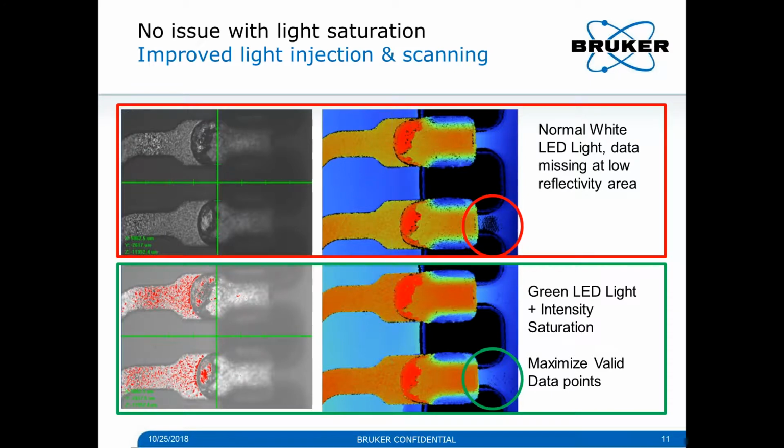First of all, when we think about white light interferometry, there is a sensitivity toward light saturation. But on some occasions, especially for rough samples like wire-bond surfaces, you may want to bring in more light, because if you don't, you may miss data in some regions and have dropout of data. Nowadays, this vertical scanning interferometry mode, called VSI mode, is very much insensitive to saturation. So the user can really saturate a lot, so that even the darkest regions get measured.